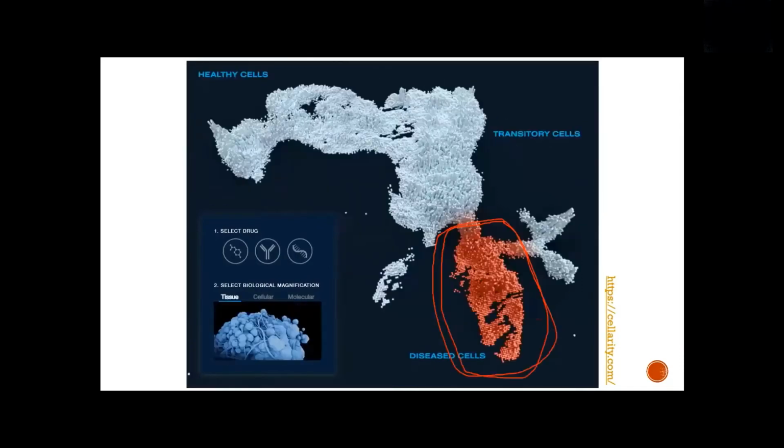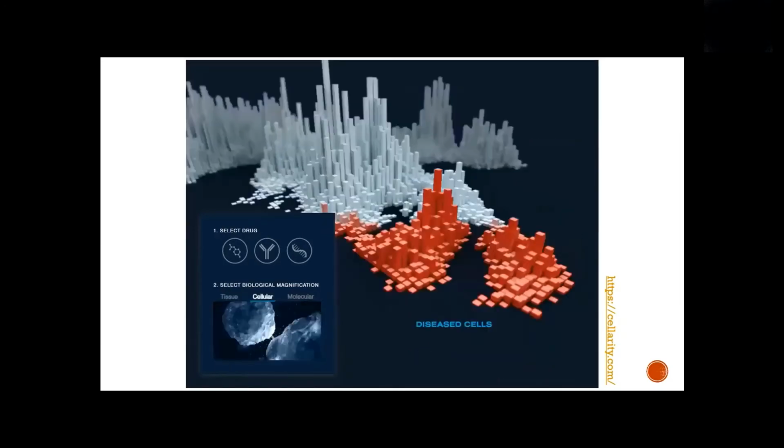Excuse me, I also have a question. Is this the single cell sequencing? Yeah, you can do single cell genome sequencing or single cell mRNA sequencing. And this is from a droplet that they find all this? Yeah. So each point will be a cell, and you have all the gene expression information for this cell.